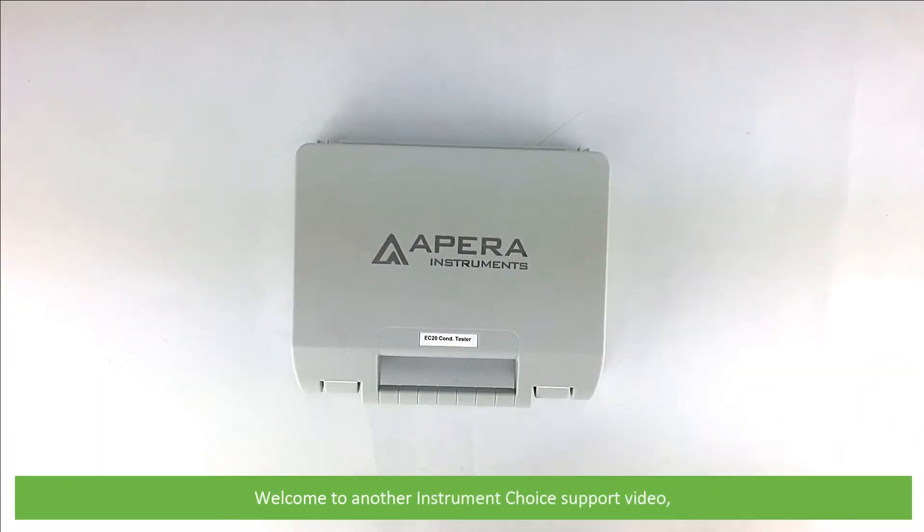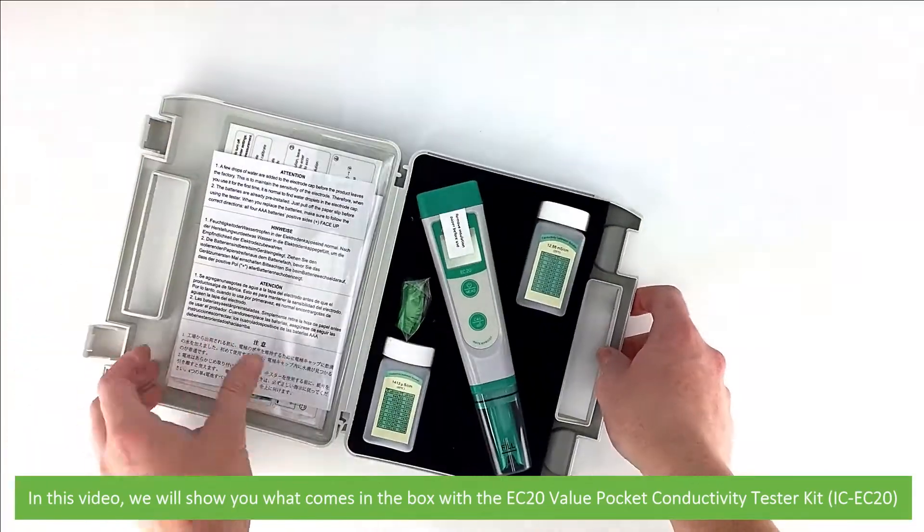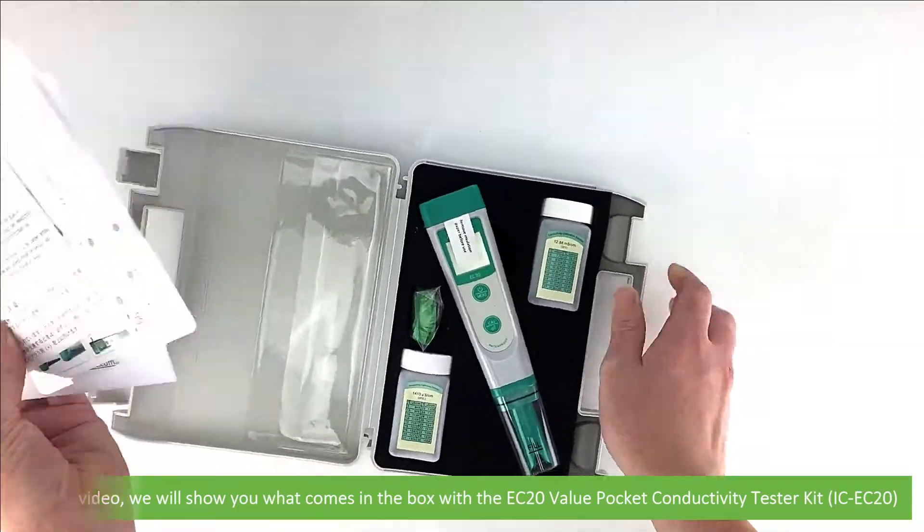Hi and welcome to another Instrument Choice support video. In this video we'll show you what comes in the box with the EC20 Value Pocket Conductivity Tester Kit, the IC EC20.